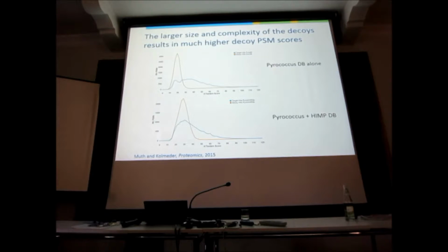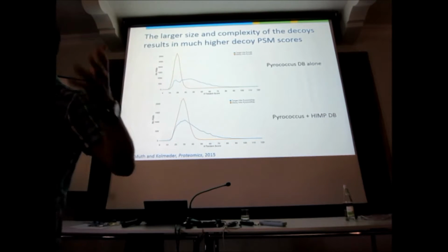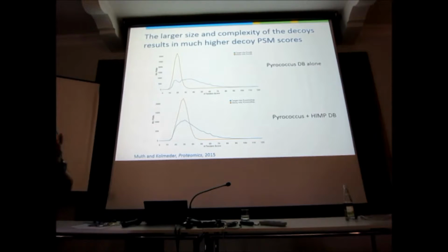Now, this is a bit strange. Why does all the decoy look like that? Well, the standard argument is it's because it's a good scoring algorithm. It can differentiate crap from real hits, and it seems to do so. When we go to the big database, the one with the intestinal metaproteome, look at what happens to the decoy scores. They move from about 18 to about 30. The decoy hits suddenly all get bigger scores. So why is that? Why does the decoy distribution shift?